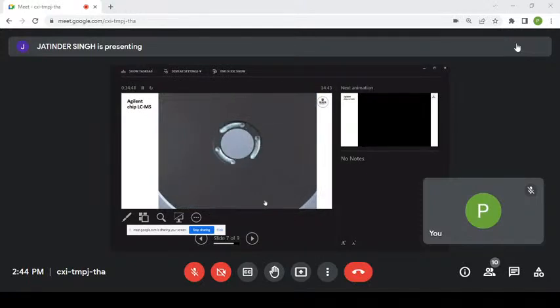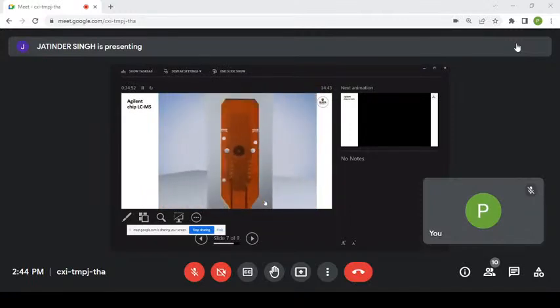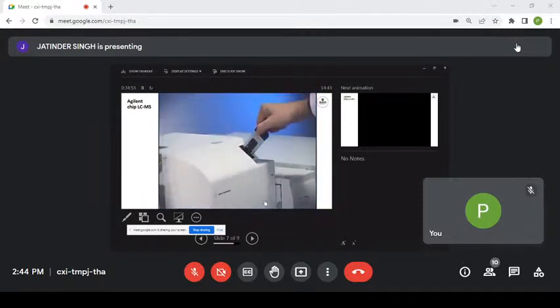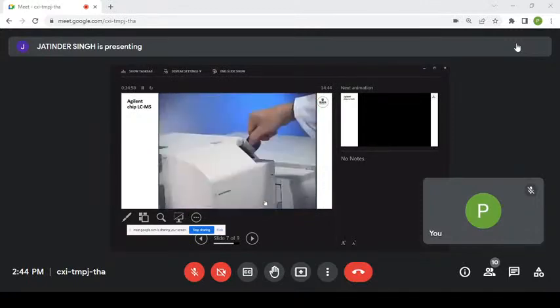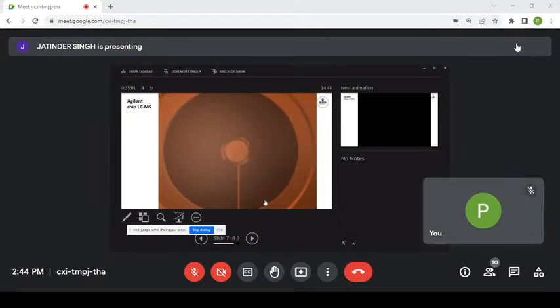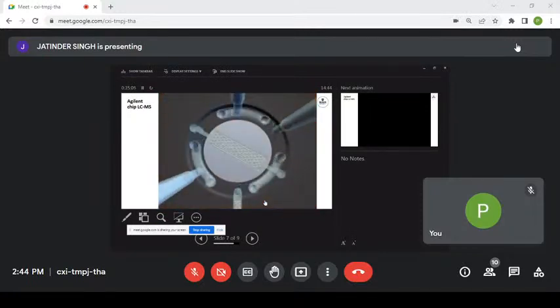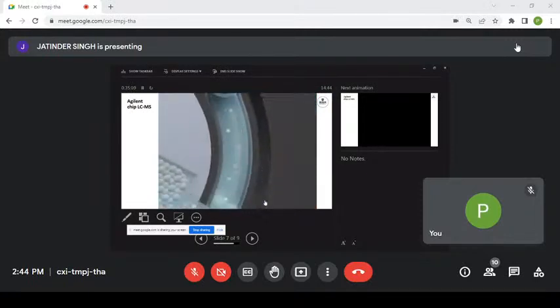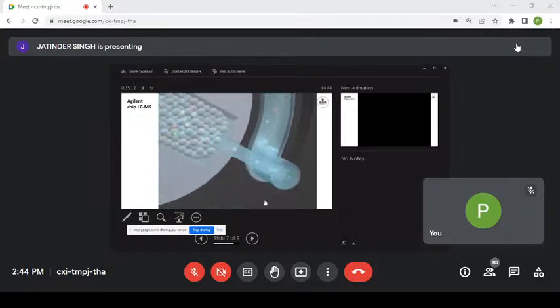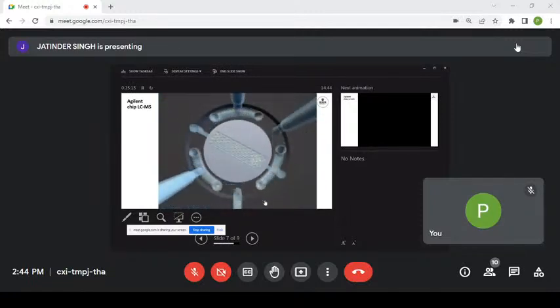So it's working like a 6-point valve, but I don't think you've had that explanation this morning on how the injector actually works into the LC system. There we go. So this is where the analytes come in. So we've got the sample in, fluidic lines. There's our mixture of different analytes. It's shown as different colored ping pong balls coming in. They go on to the enrichment step.